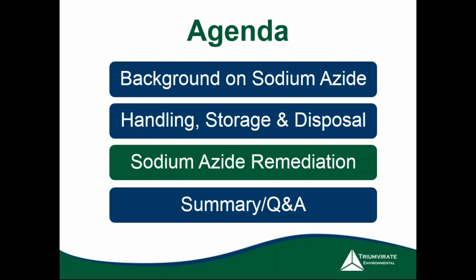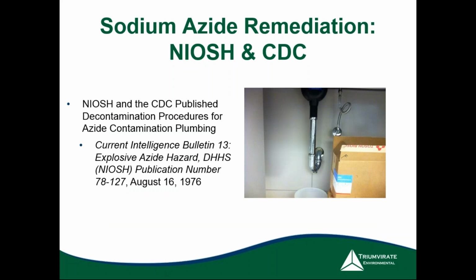So moving on, we're going to talk about sodium azide remediation. It's one of the better topics, I think, just because it's not widely known of how this has to be treated.